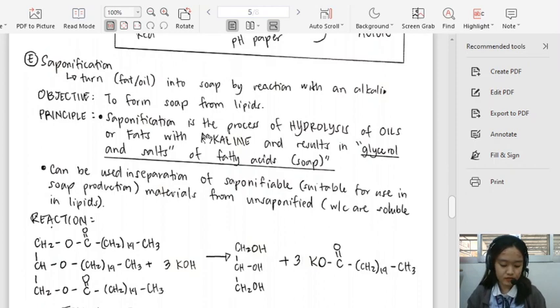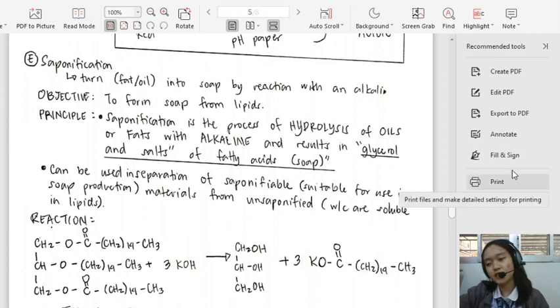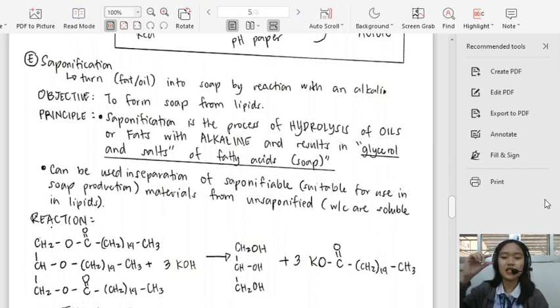Okay, is there anything else? And insoluble soaps. Unlike the others that are prepared by the laboratory, in saponification, if it is a face-to-face class, you are the one who will be making your soap. Before, my class actually performed this and they were able to form a hard or solid soap. First a liquid soap, and then by salting out, they formed a hard soap.